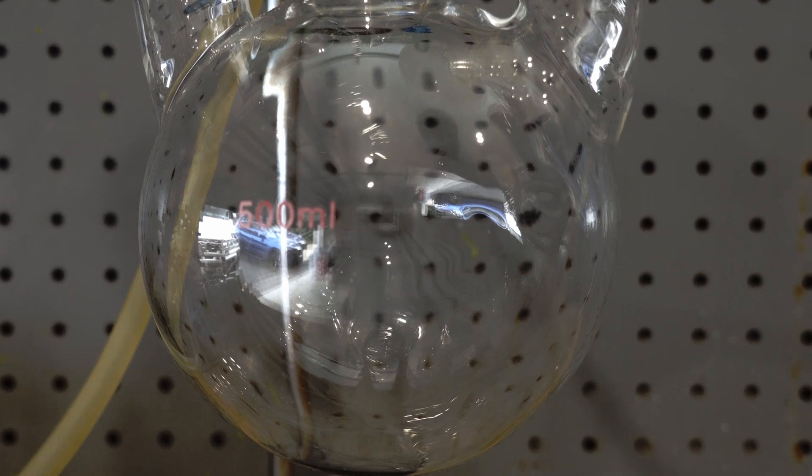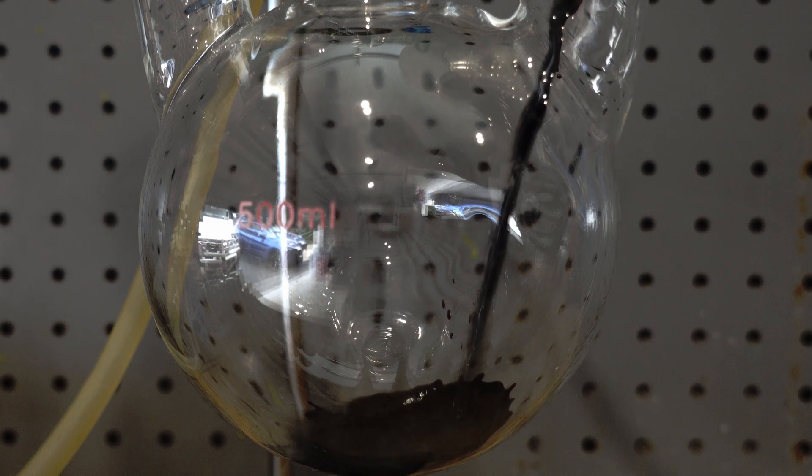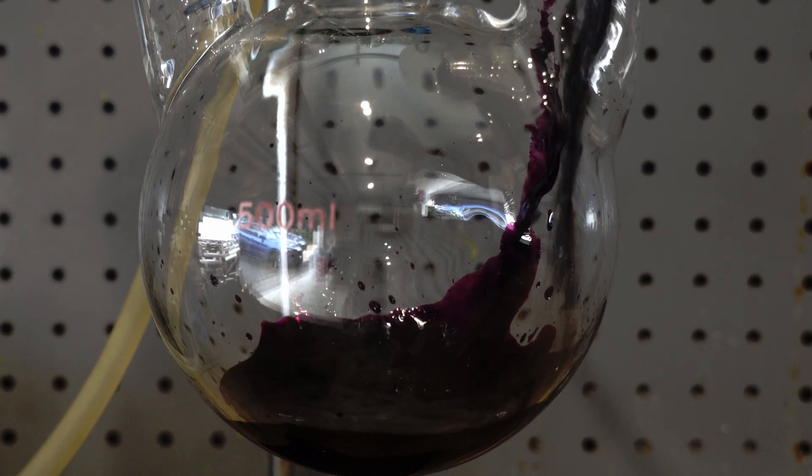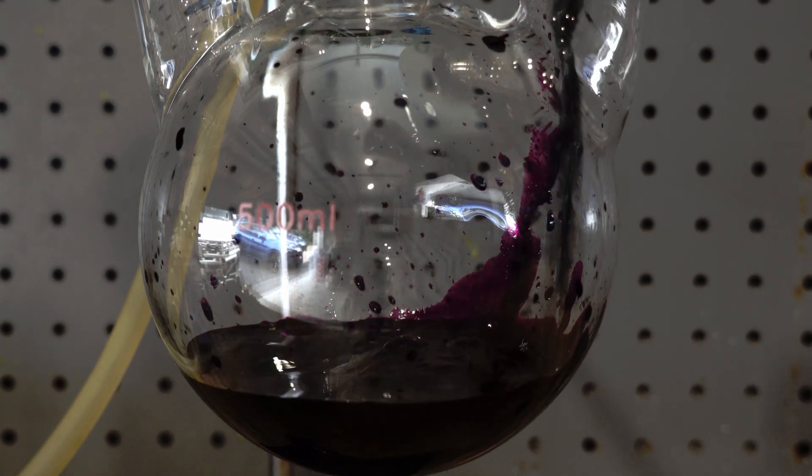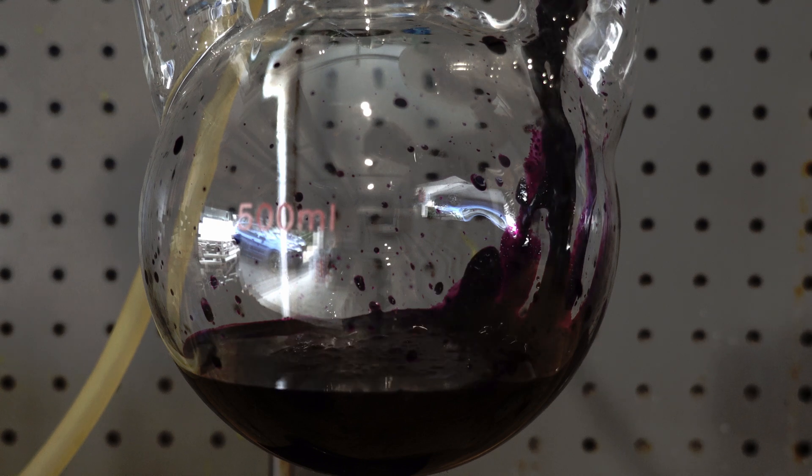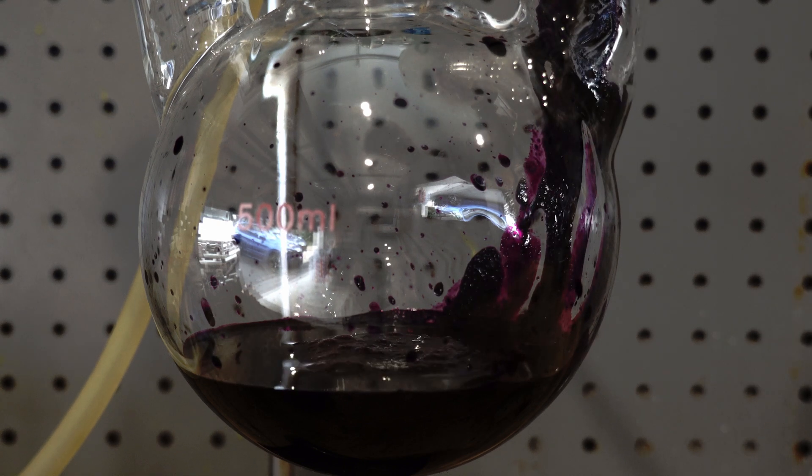Anyways, this mixture was then added to a 1000ml three necked round bottom flask. The addition was quite messy, but this doesn't affect much.